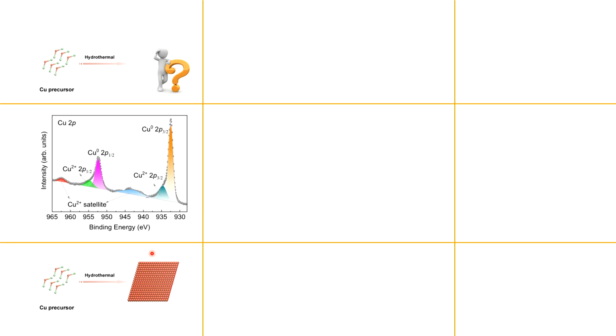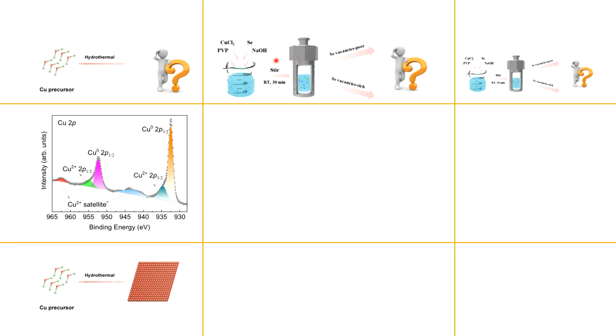If the material is complex, like it has some other metal along with the copper metal atom, or it can have some kind of vacancies, then how can we interpret that sample? For example, let's take this example in which copper and selenium, two different metal atoms, are present and also have some vacancies. So how can we estimate the structure in this case?